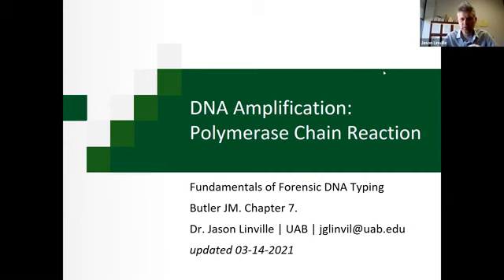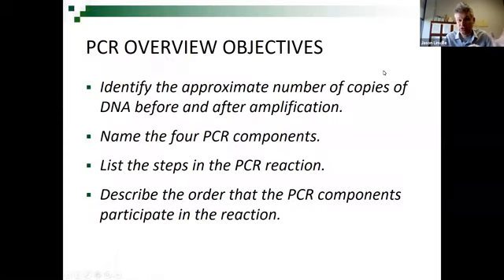So we're going to have a couple of polymerase chain reaction lectures. There's, I believe, 4 of them. And this first one is just an overview of the process, as far as what PCR is, what the polymerase chain reaction is. In some lectures on the syllabus, the lab may be called DNA amplification. It's the same thing. The polymerase chain reaction is the process used to amplify DNA. So sometimes those terms, DNA amplification and PCR, are used interchangeably.